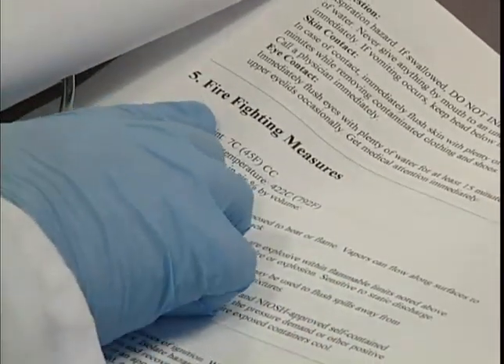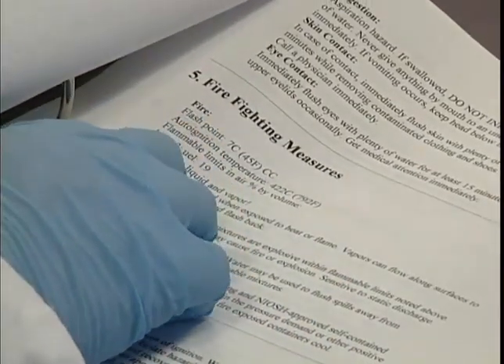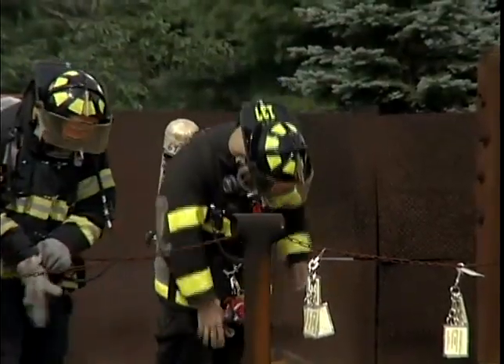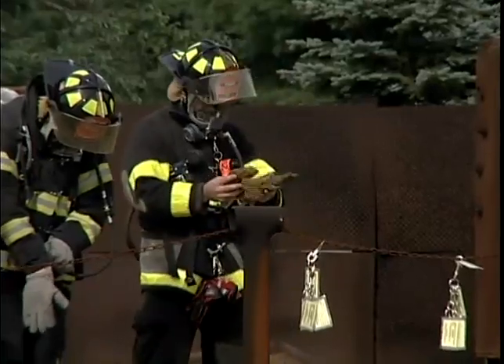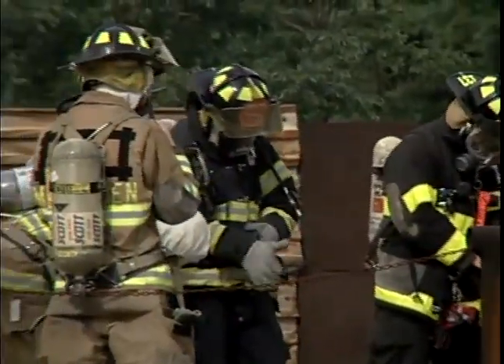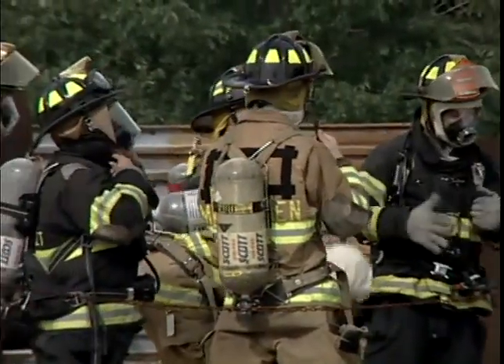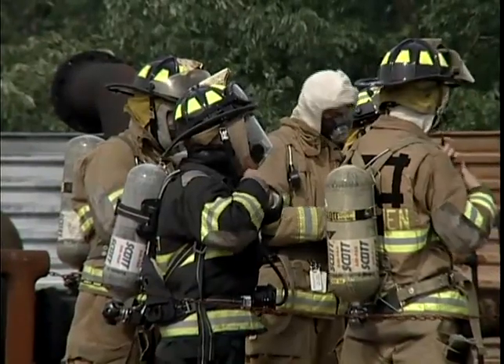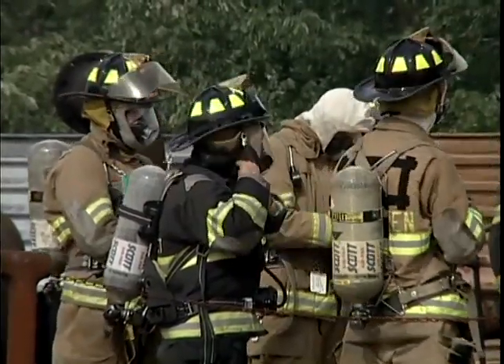Firefighting instructions describing basic strategies that minimize the hazards the material may present in a fire are also provided here. The personal protective equipment necessary for firefighting will be listed in this section as well. This usually includes the full firefighting gear and an SCBA, self-contained breathing apparatus. Even more protection may be necessary for some hazardous chemicals.